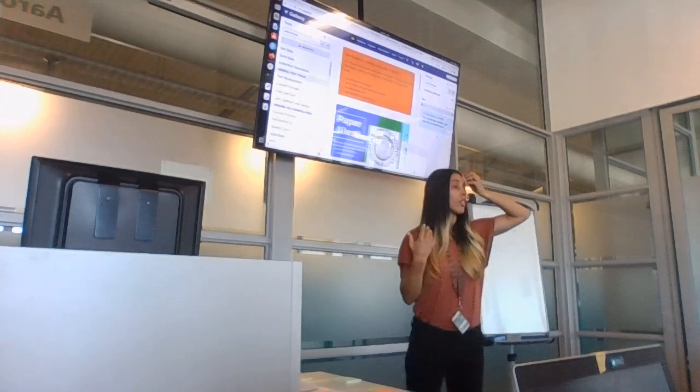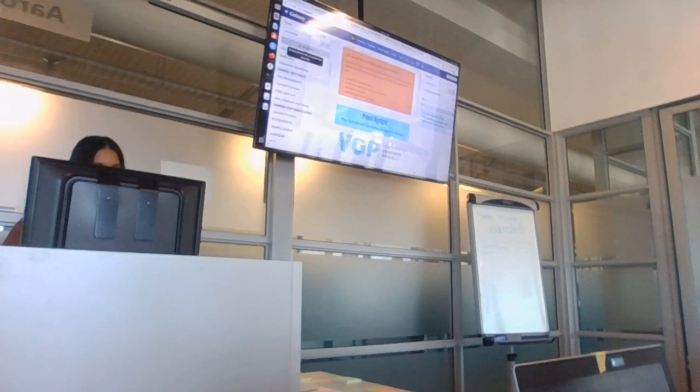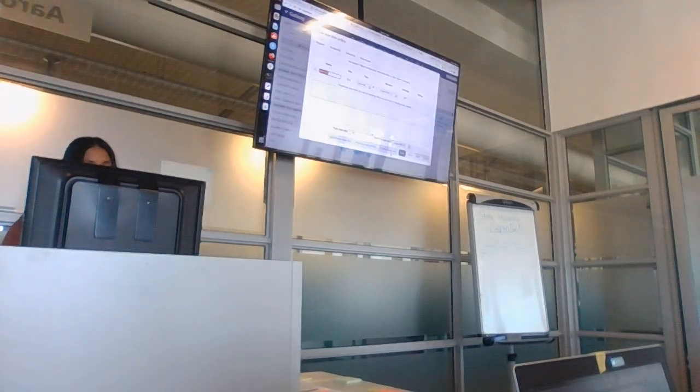Upload, and then paste and fetch data. Choose local files because it's on your local machine. So now you're not going to use this one.